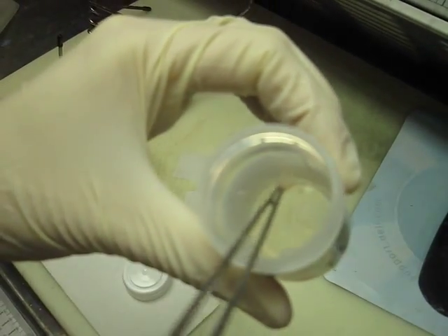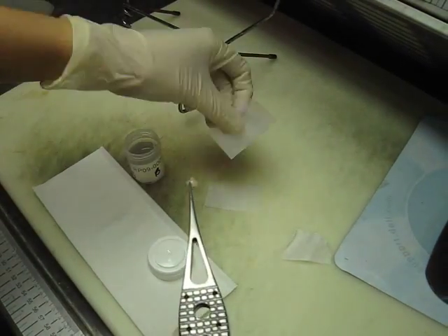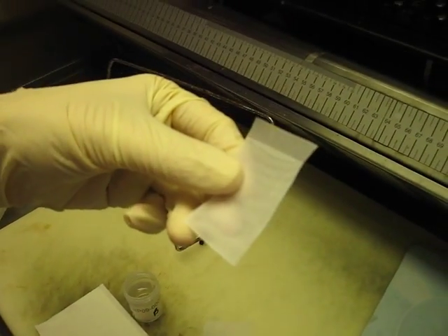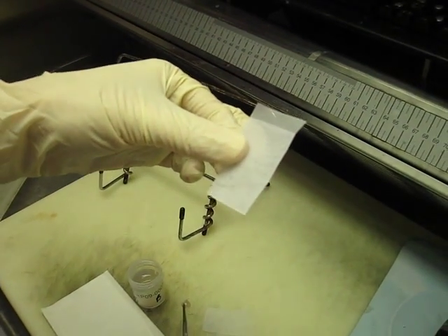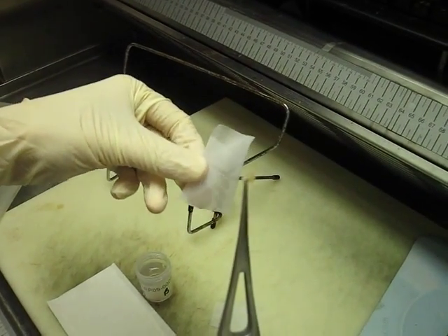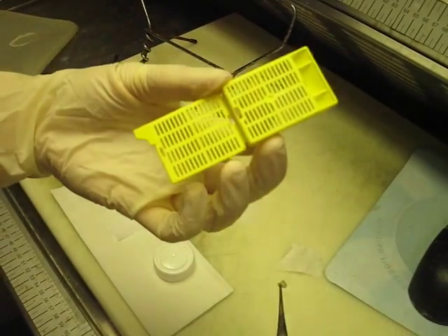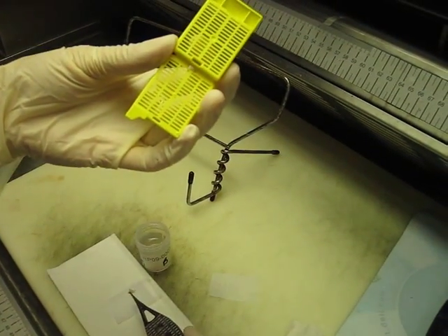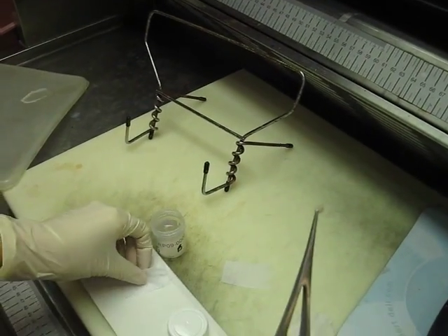Usually biopsy specimens are tiny. So this particular specimen, we put it in one of these mesh tea bags. Sometimes it's just a piece of paper. And the purpose of this is so that the specimen, it might be much smaller than this, doesn't fall apart in processing. And then together we put it in a cassette, and as you can see, the cassette has a grid on it. So we put it in the tea bag also to prevent it from falling through the grid and disappearing. You can never find it again.